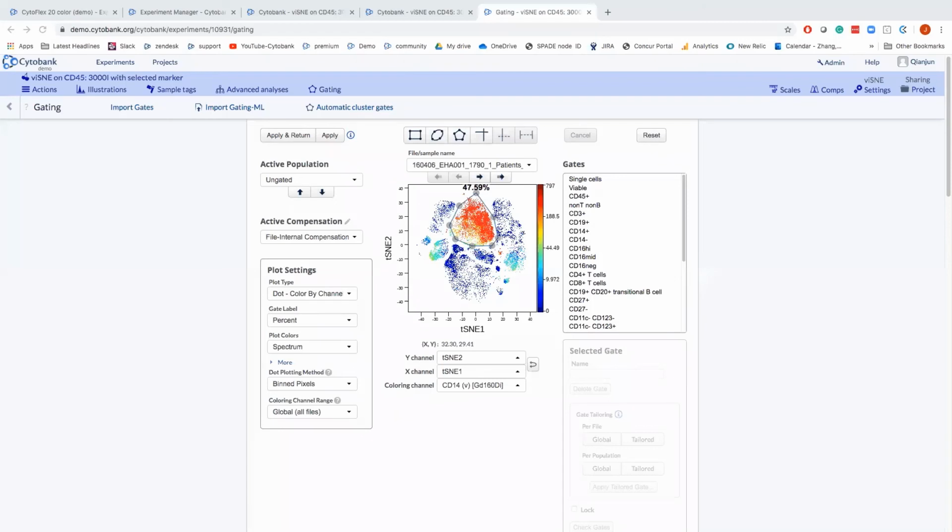So in order to compare a longitudinal study in viSNE, we still recommend you run viSNE on all files in one run. That goes back to the original question of how many events you can take. If you run large studies, we recommend including all files by doing some pre-processing, so you can include all those files with different time points and do the viSNE comparison.